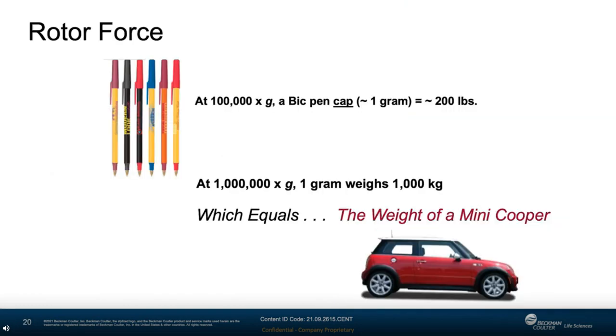Part 3, safety considerations. When people teach centrifugation, we often use the example of the spin cycle on a washing machine. While that uses centrifugal force to remove water from your towels, it's really a terrible example because the force involved is so much less than what we use in laboratories. I teach new centrifuge users, and it's my observation that many high schools have tabletop microcentrifuges, the little ones that spin 1.5 mil flip-top tubes.